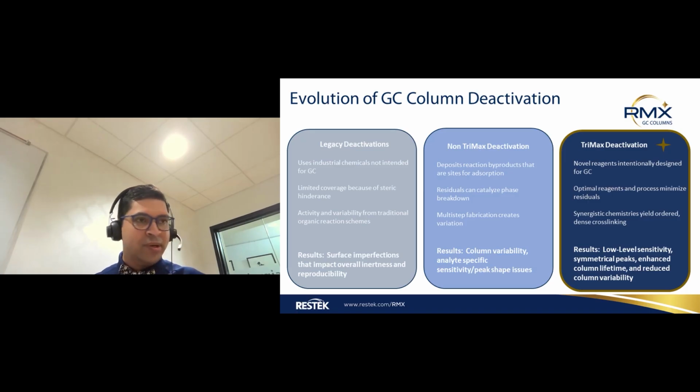Now let's move one step ahead and look at the timeline. We are talking about non-Trimax deactivation. The depositing reagents used in the manufacturing process could create byproducts that can stay in the column. Now, the deposition of these reagents within the column, again, might be minute, but they create residuals inside the column that can actually catalyze your stationary phase itself.